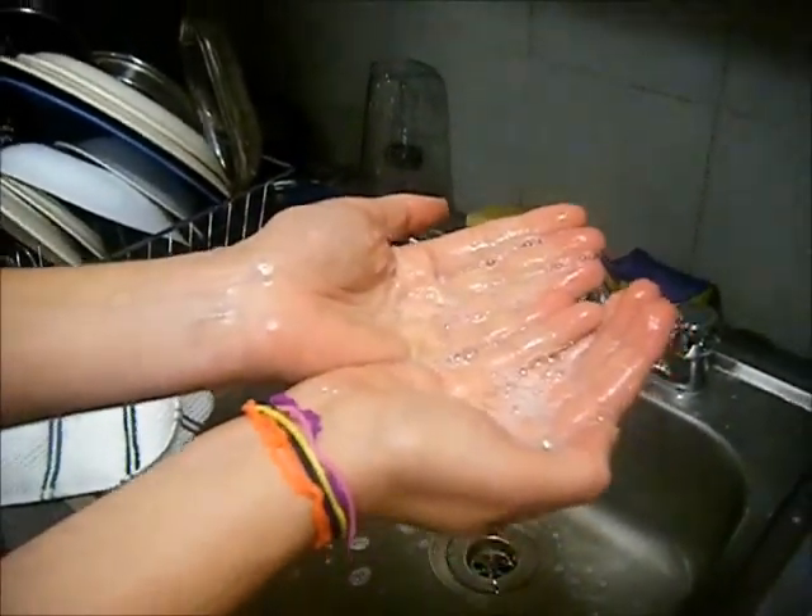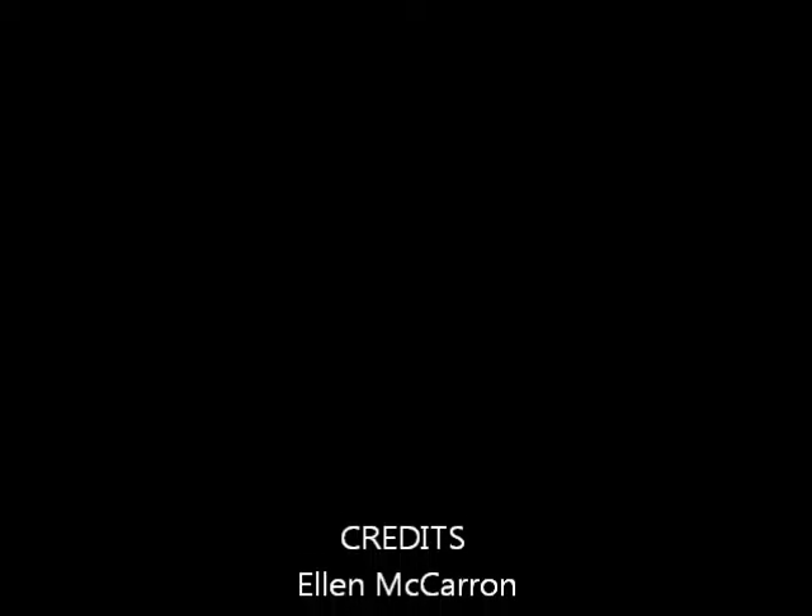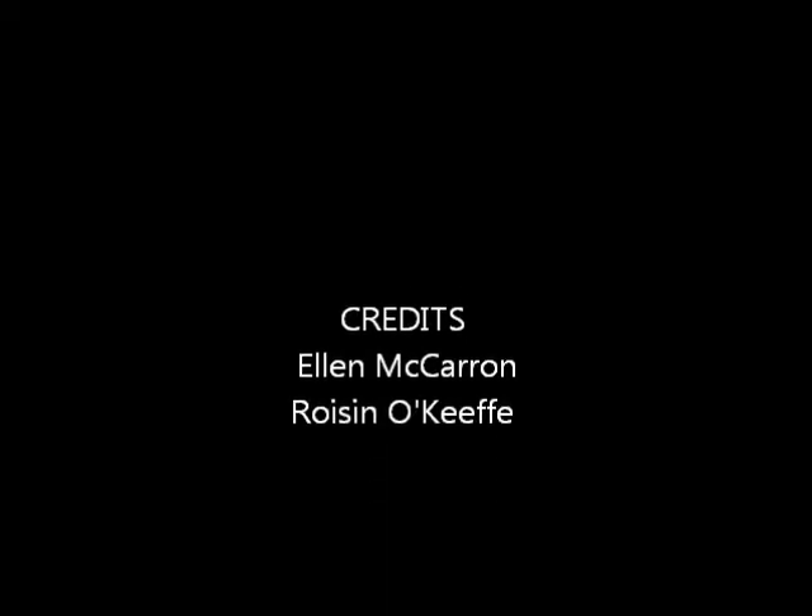This shows the water from the tap has more hardness than the bottled water.